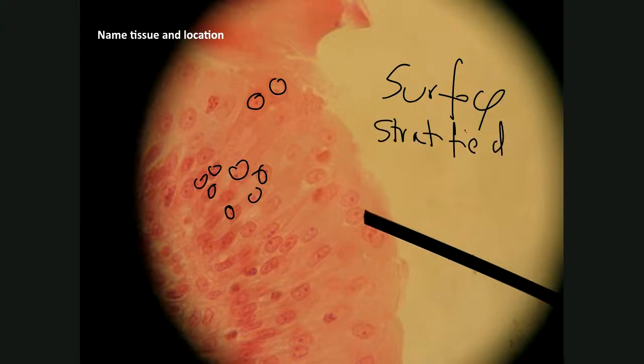We had 3 stratified epithelium that we saw. We saw keratinized stratified squamous epithelium, non-keratinized stratified squamous epithelium, and transitional epithelium. The first two epithelium were squamous with flat cells. Well, the nuclei of these little cells here on the top is round, suggesting either square cells or round cells.